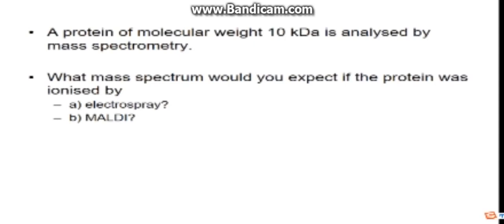Now, really, you have to use time of flight with MALDI because the mass to charge range is another characteristic of a particular mass analyzer. With the time of flight analyzer, the mass range is virtually infinite because if it's just a bigger molecule, it will take longer to travel the drift tube, the field-free region.